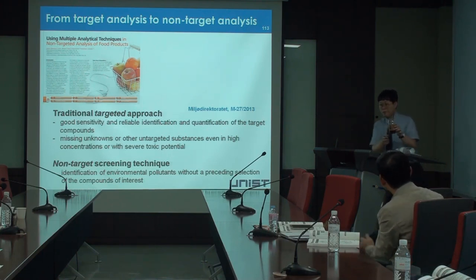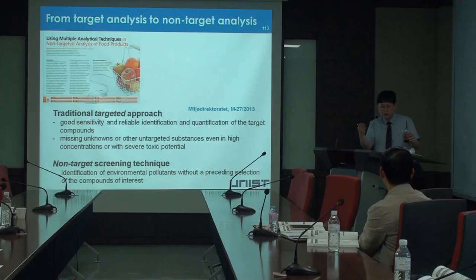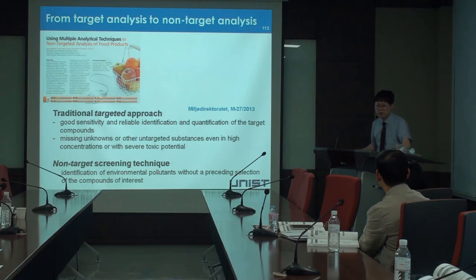The non-target approach is that not only dioxin, but also many other POPs or other POP-like chemicals, we want to analyze everything and to see which chemical is newly detected. Okay. Currently, we only focus on Stockholm Convention POPs, but it's not perfect. There are many other types of POP-like compounds, so we want to analyze them. This is non-target screening.